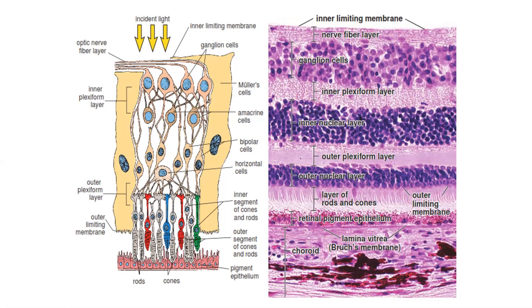In this layer you can appreciate one thing, that the nuclei are relatively of larger size. These are basically the nuclei of very large ganglion cells, and they have a large nucleus. These ganglion cells are third order neurons, and they are basically multipolar neurons. Their dendrites make synapses with the inner plexiform layer, and their axons exit to form the nerve fiber layer in the next-coming inner layer.